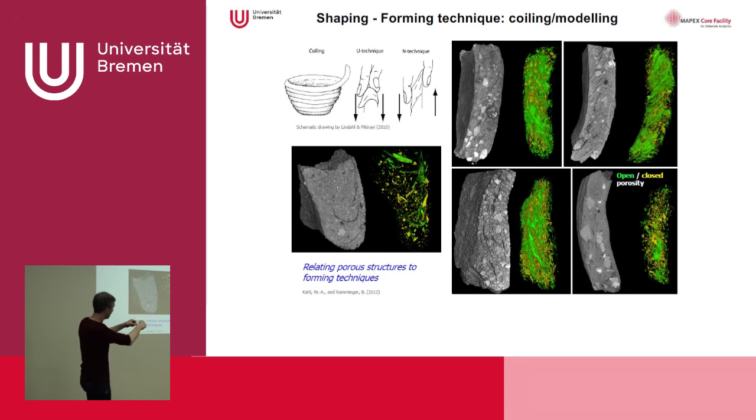You have a coil, you have some techniques to make it smooth, and you see different techniques for different ways of porosity. So you could do that with Fiji. I was really coloring two models with Fiji. Porosity here, and you can make a 3D model of the porosity and use Fiji, a very simple program, to get these kinds of results.